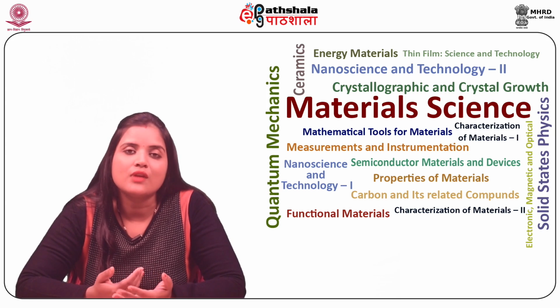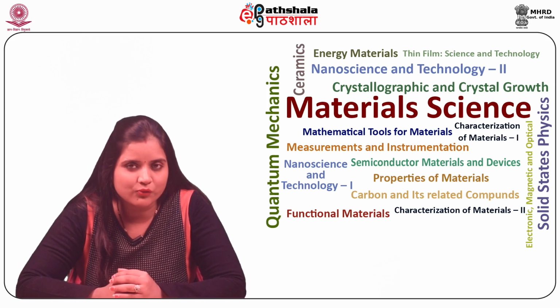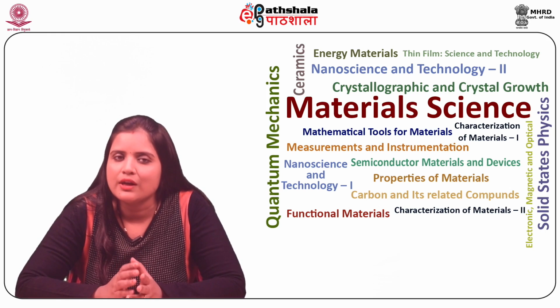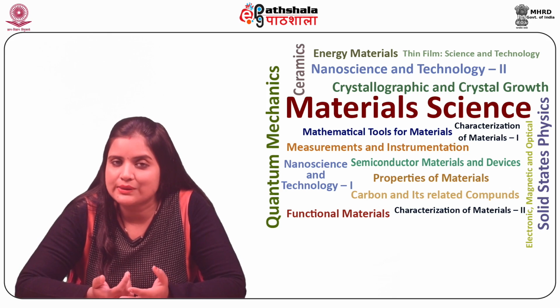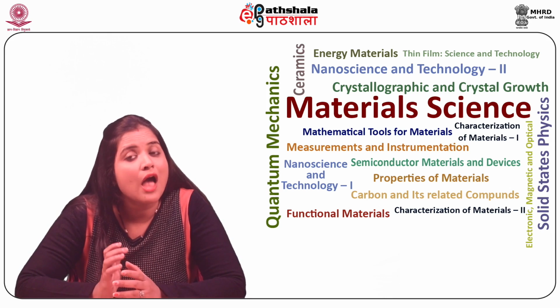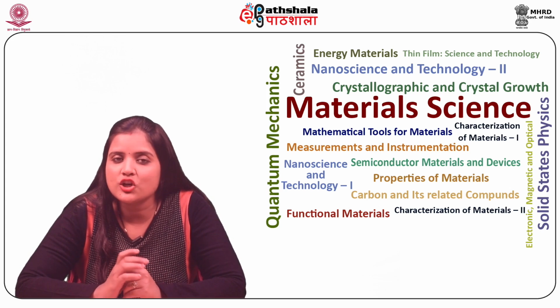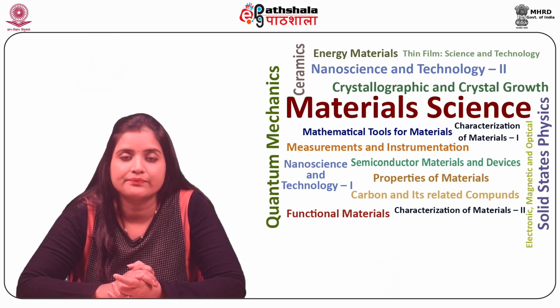We will now study the advantages of oil immersion microscopy. The majority of manufacturers use the oil immersion technique as it can be reused for a second slide as well in specific conditions. Also, it can be used with wide condensers. An important advantage of immersion microscopy is that the objective has long focus at low power. Also, this technique can be used on inclined stages, for example, horizontal and various slanted angles.